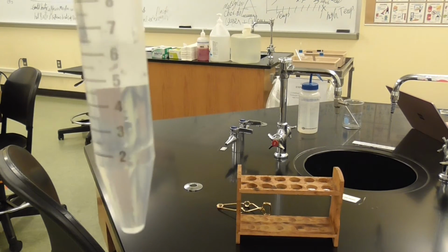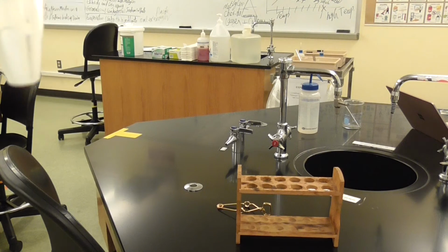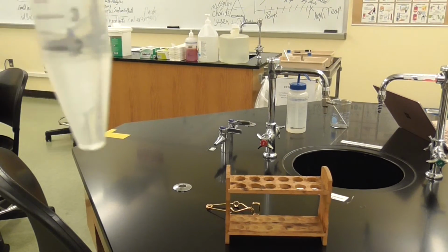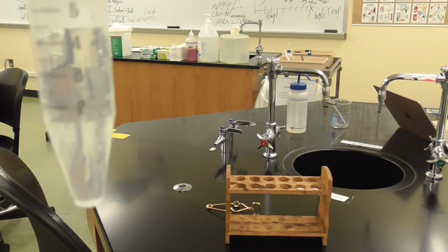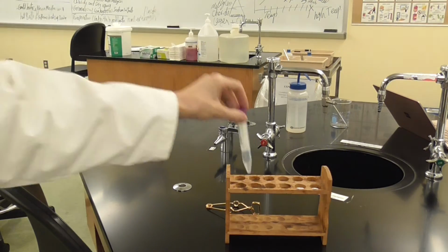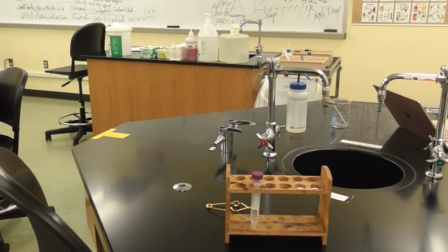Now we are going to remove the lower layer because methylene chloride is more dense than water. So the lower layer is the organic layer and the top layer is the water layer. So I'm going to prepare the Pasteur pipette and then try to remove the lower layer.